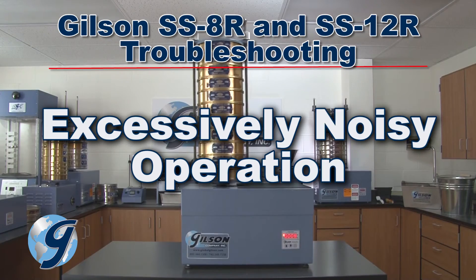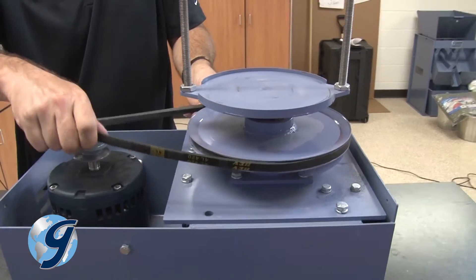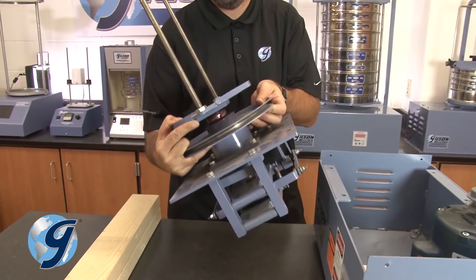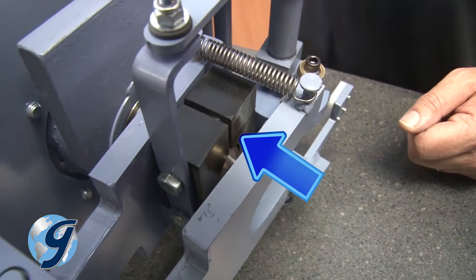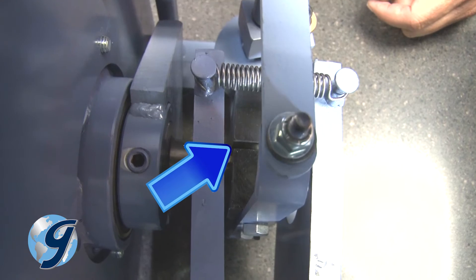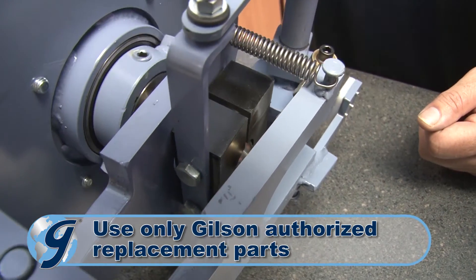If the unit operates but is excessively noisy, you'll need to check the bumper block. Remove the drive belt from both pulleys and lift the entire assembly as previously instructed. Now check the resilient faces on the bumper block for any excessive wear or damage, and replace the bumper block if necessary.